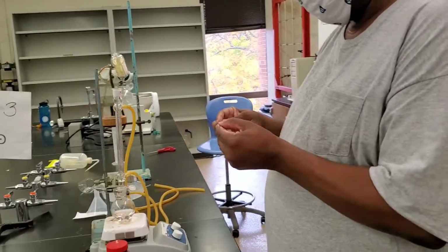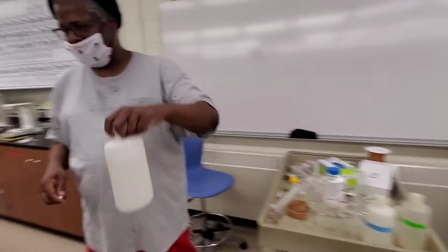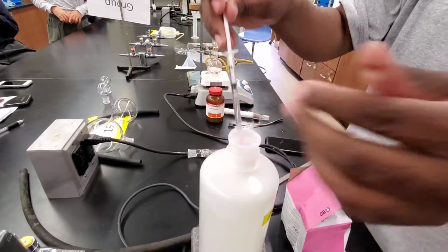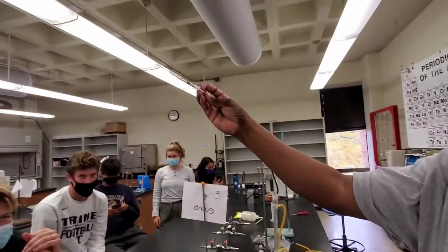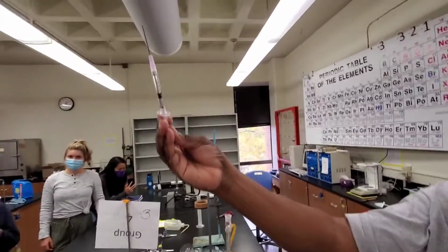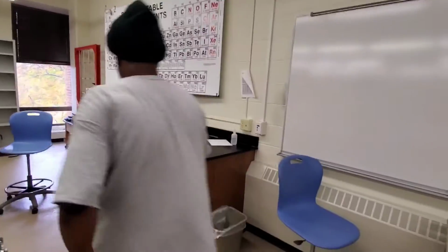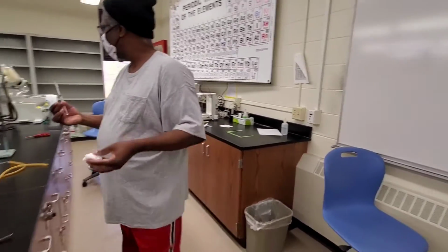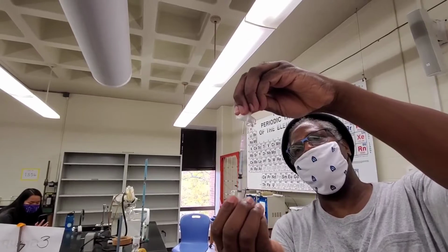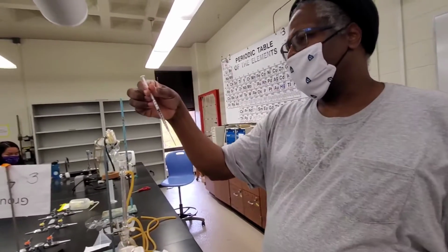Okay? So, let's pull up some liquid. Let's try ethyl acetate. Okay? If you notice, you will see bubbles in there. That often happens. That's not uncommon at all. So if you pull up a reagent and you see bubbles in there, what you want to do is do like this, and then this, or we may have some brown paper towels around, to try to get those bubbles out. And get it to the right amount that you want.